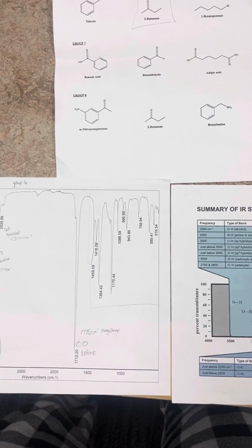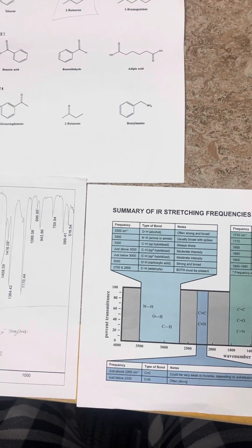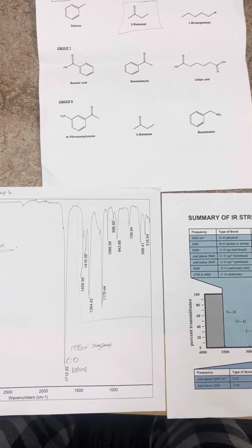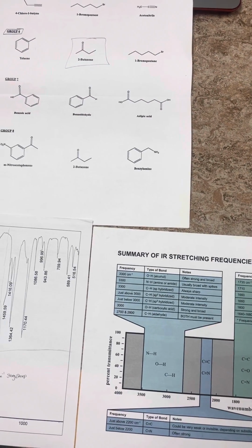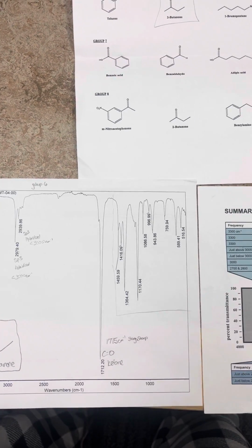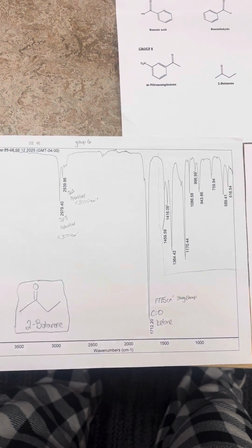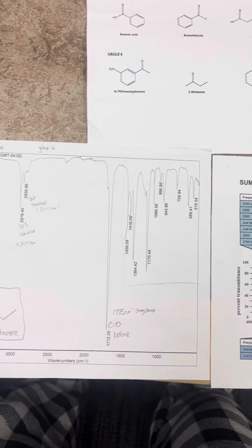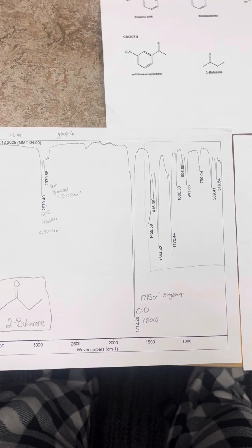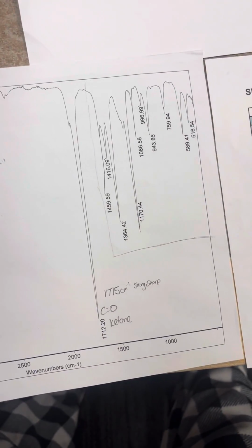So first, I recorded an infrared spectrum of an unknown sample equipped with a spectrometer, where the liquid was put on an ATR crystal. And then the sample was also tested at room temperature. And then the spectra were corrected and normalized for the presentation.